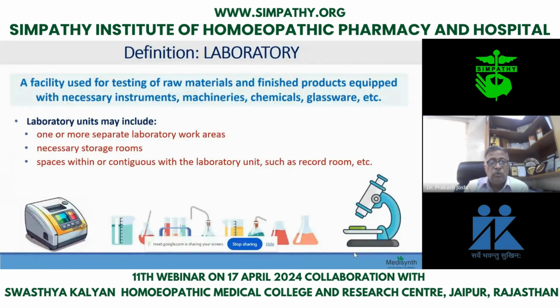First of all, one should know the definition. As I told you, the presentation is already with Dr. Khan Sahib, so he will share it with you. I will tell you something more than what is given in it. It is the facility used for testing of raw material and finished product. As I told you, it is the responsibility of the quality control laboratory. And now the GMP says quality assurance. Quality assurance means that you have to test right from the raw material to the finished product.